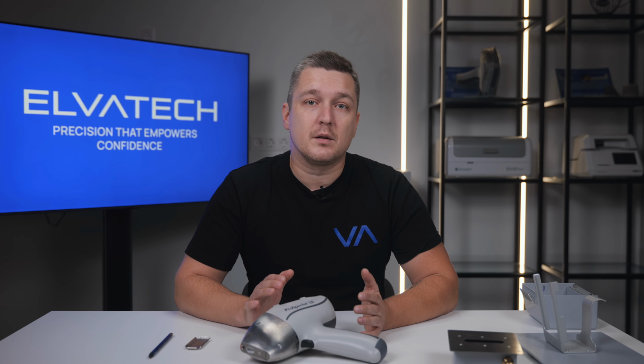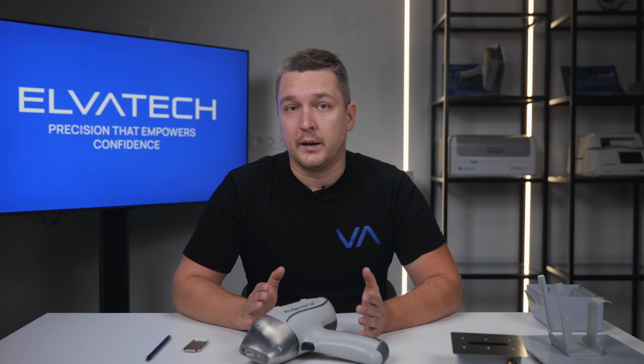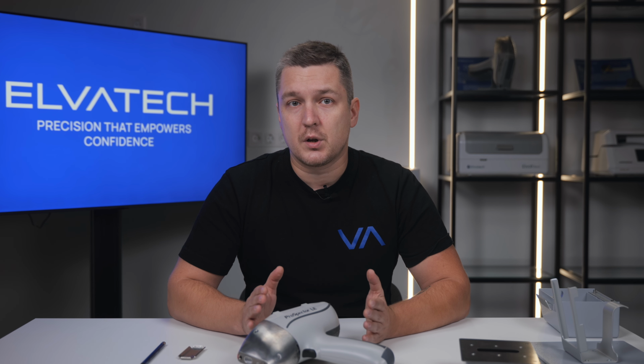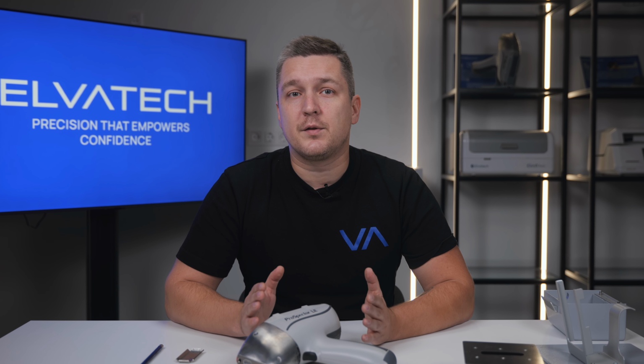So we have just reviewed the 5 main alloy analysis modes in the ProSpector 2 analyzer. Each has its advantages, so choose the one that best fits your tasks.